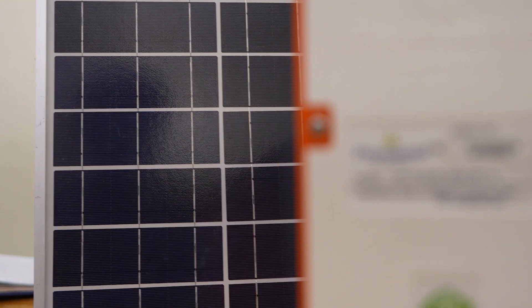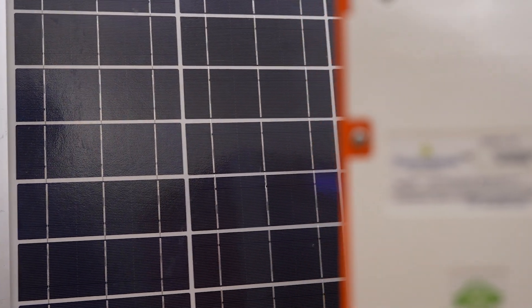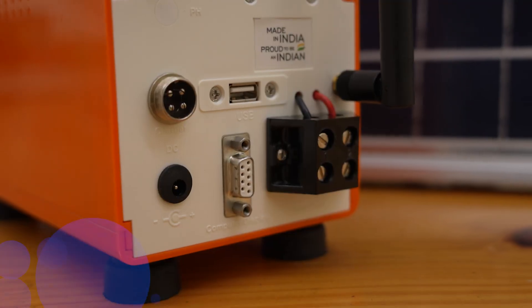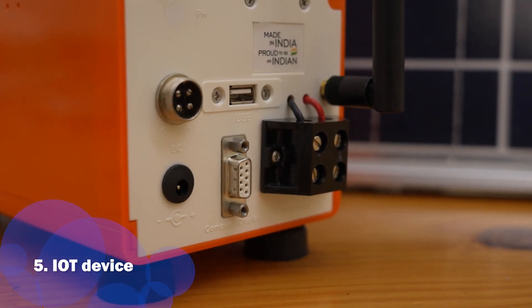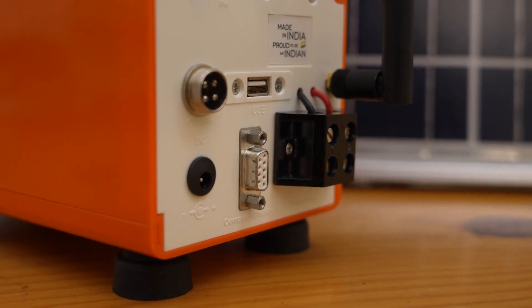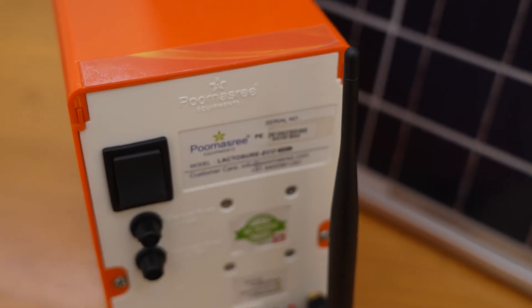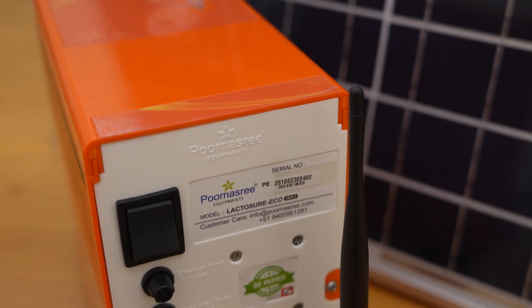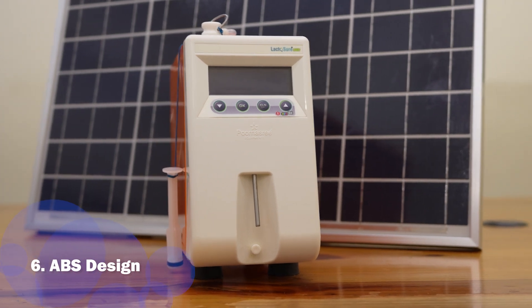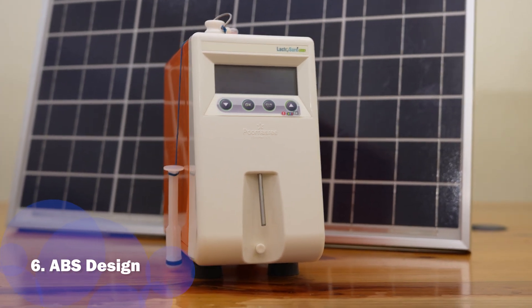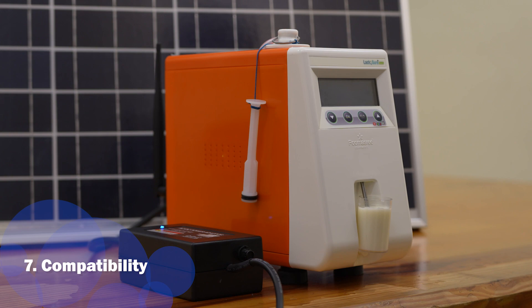Solar panel provided is of 50 watts. It is an IoT device having USB connectivity, wifi connectivity, and serial printer connectivity. Its strong ABS body gives a good finishing. It is compatible to all the weighing scales and software at present in India.